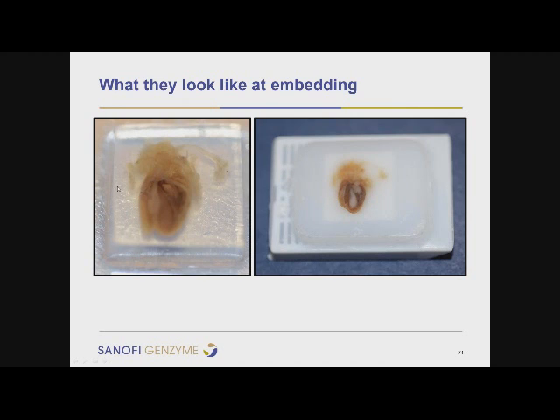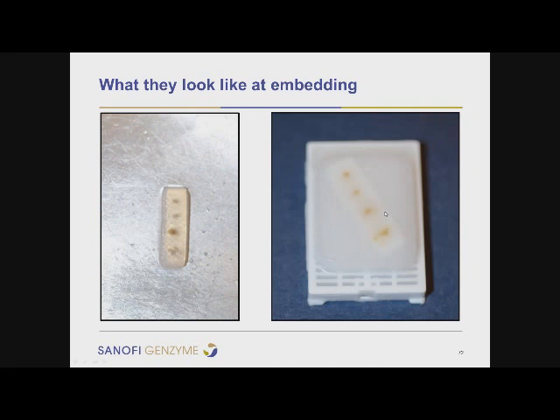And this is what one of the heart samples with aorta look like, and they're really kind of cool. This is what it looks like as it comes out of the processor, and here's an example of a block. And you can see we were able to get the gel inside here, and that's going to prevent bubbles and some of the sectioning problems.